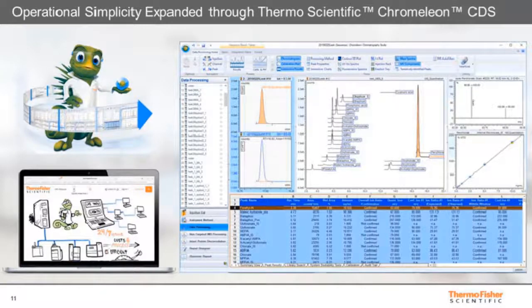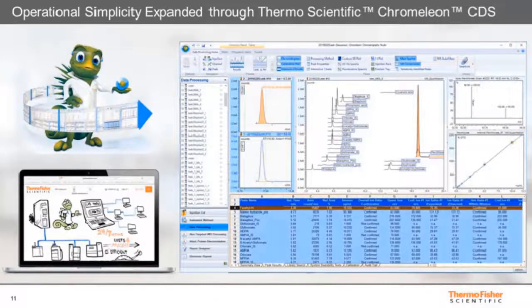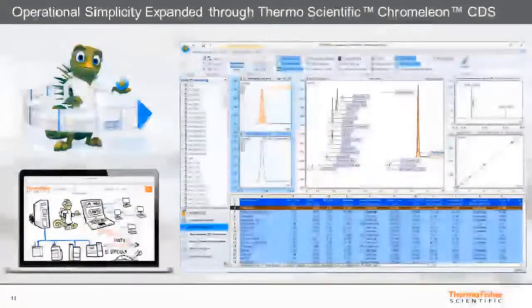The screen on the right-hand side shows, for instance, for a selected analyte, in this case perchlorate, quantitation and confirmation ions, linearity, and ion ratio deviation, using a color-coded flag to visually highlight compliance and non-compliance throughout the sequence.